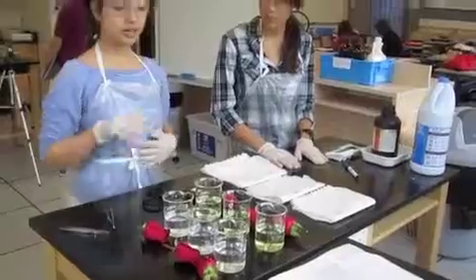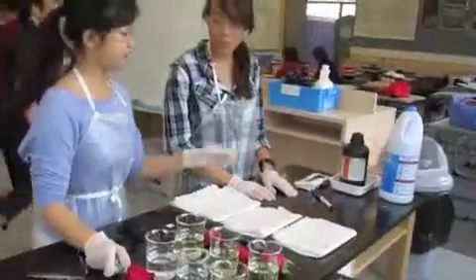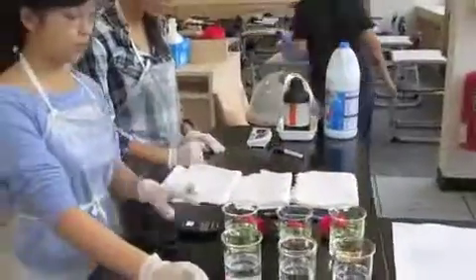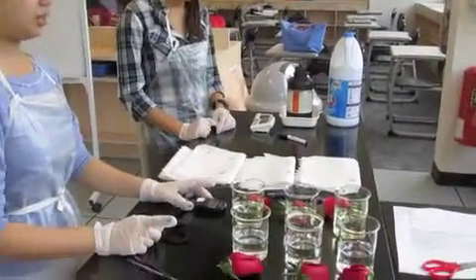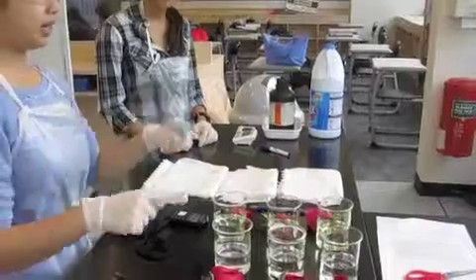Here we have our setup. We have 3 timers, one set for 1 minute, 5 minutes, and 10 minutes. The beakers labeled with A are going to be timed for 1 minute. Beakers B will be timed for 5 minutes, and beaker C will be timed for 10 minutes. After the designated time, the roses will be taken out and dried.